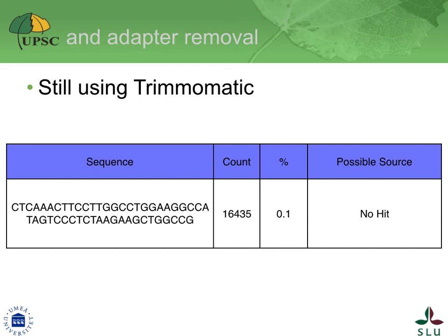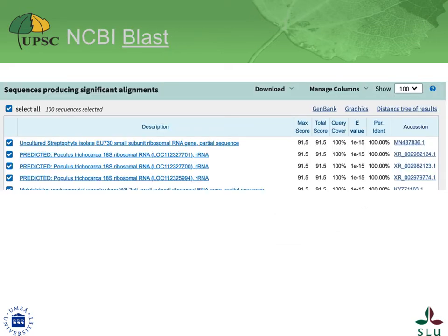I would copy-paste the sequence into the NCBI BLAST webpage. As it were, I just did that — see the next slide. The sequence is an rRNA. Take another minute to think whether we should be surprised by this. Let us reflect on the amount and types of rRNA in the cell.